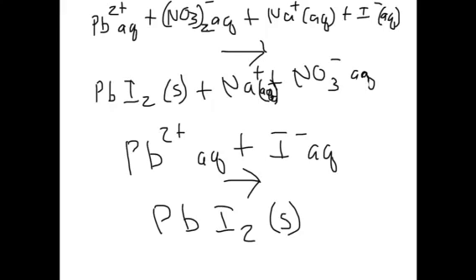Due to the fact we didn't record class data for number 7, I'm just going to go off of a hypothesis and say the inconsistency we had was, what if other people in number 3 had different reactants in the spot plate test?